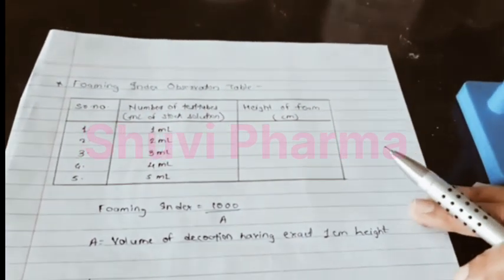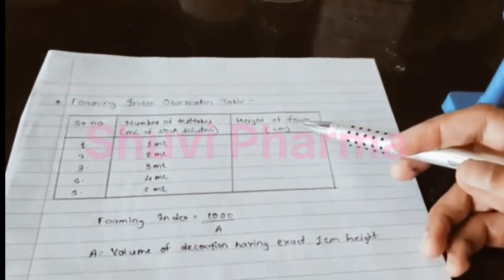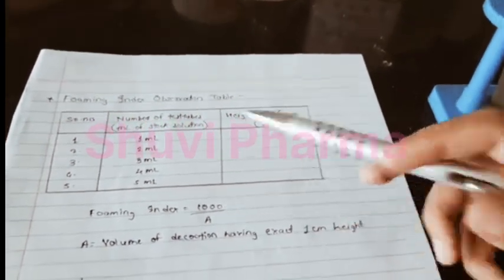So before that, I have prepared the observation table for foaming index. These are the test tubes containing stock solution 1 to 5. Now over here we will note down the height of the foam in centimeter. Then we will calculate our foaming index.